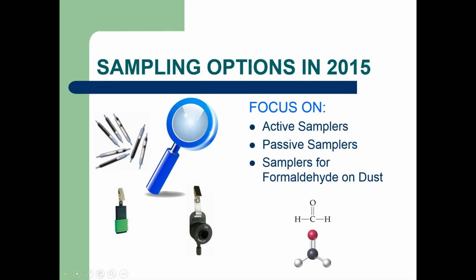So let's take a look at sampling options for formaldehyde in 2015 and note in particular the advantages, disadvantages, and applications for each.